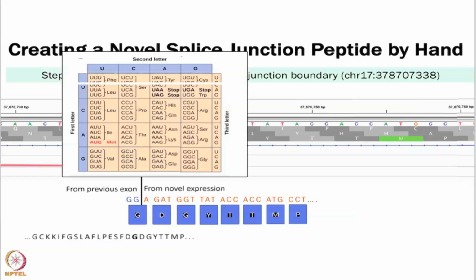For the junctions, we are showing how to see where 2 exons are connecting. This one shows these 2 exons connecting. And the red one shows an exon that's connecting to the middle of an intron, which makes no sense, right? We wouldn't expect to see that because we expect to see 2 exons joining, but not an exon and expression in an intron.